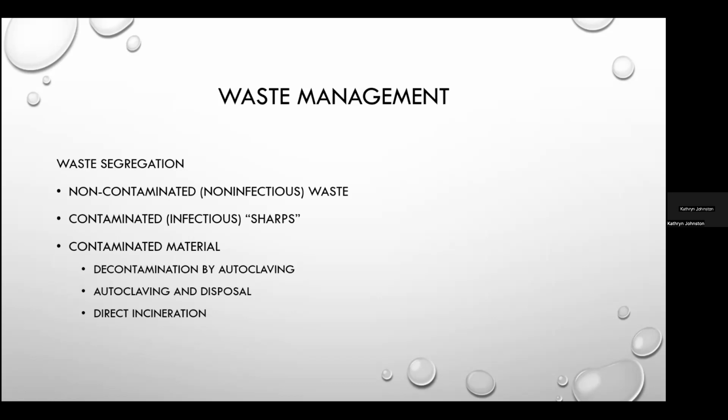Waste management. We talked a little bit earlier about, we have a typo in here. We talked about this a little earlier when I talked about waste segregation, and I talked about the general household waste, which is the non-contaminated, non-infectious. That includes office waste, papers and items that aren't used in the performance of laboratory procedures.